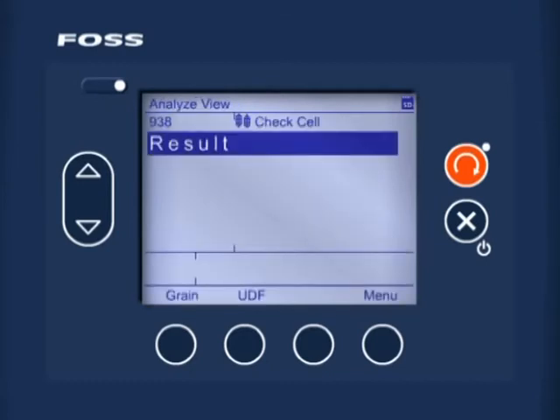When the instrument has completed its start-up test, the words 'check cell' indicate that the instrument is now in check cell mode. Press the orange soft key to start the check cell analysis.